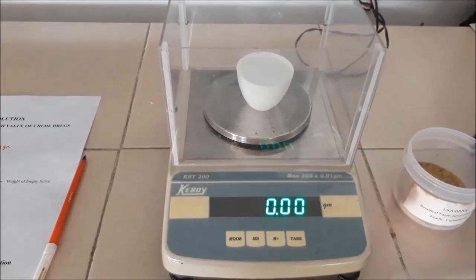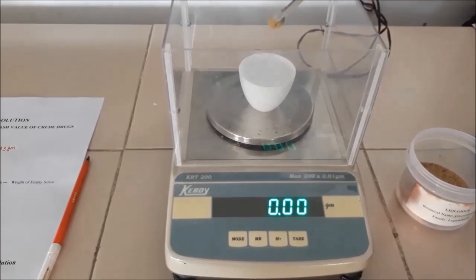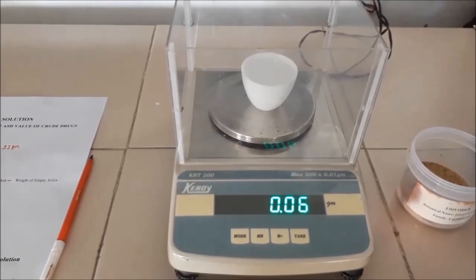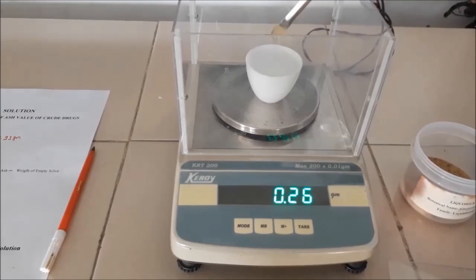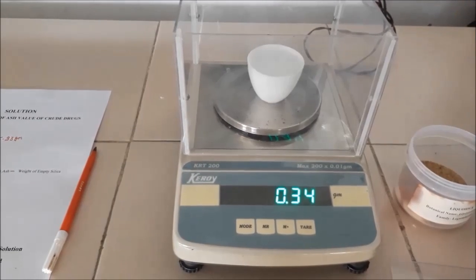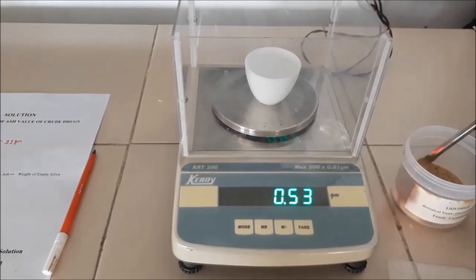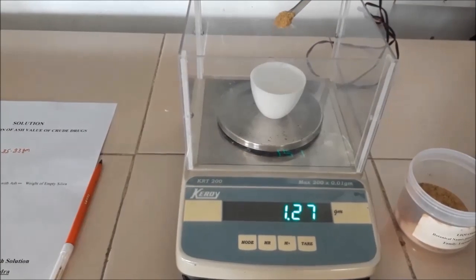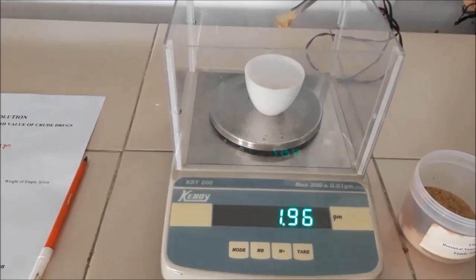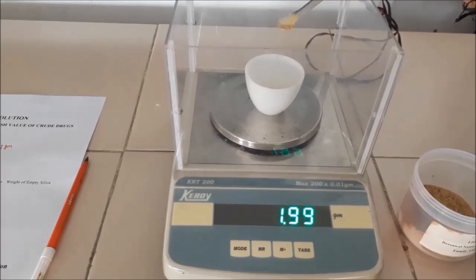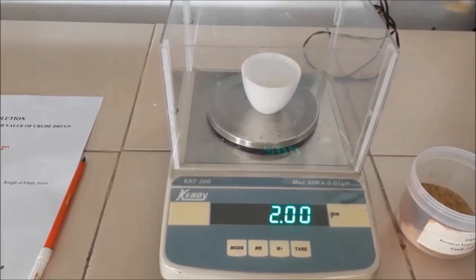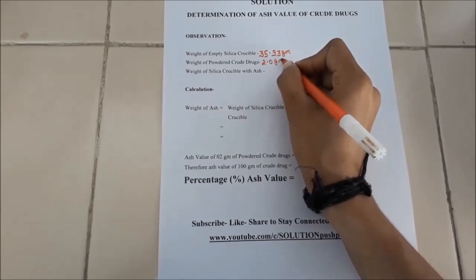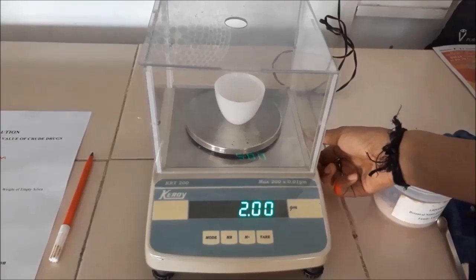Tare the weight of the silica crucible to get zero. Now accurately weigh about 2 grams of the powdered air-dried crude drug of which we have to determine the ash value. You can also weigh between 2 to 4 grams or any other specified amount for a particular drug.